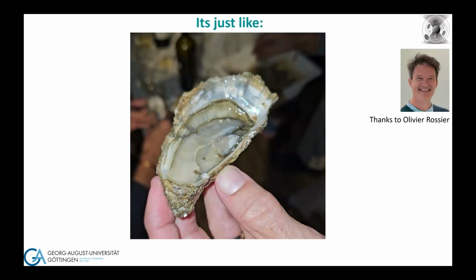Or you can ask the very simple, naive biophysicist question that I'm asking here: what force does it pull? And in the end of the day, all I showed you so far is basically the same thing. To answer that question, you would just have to quantify a little bit the displacement, this flow. It looks a little bit like a lamellipodium here. If you would know the viscoelastic properties, you can use the same kind of physics to extract the forces. And if you really know where all of these displacements are, you have a good chance to know spatially where, at which moment, these forces are applied. I didn't go through all the math yesterday, but I wanted to share that with you.